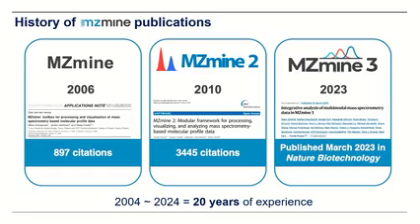Now, as you probably know, MZmine has quite a bit of history around it. We actually just celebrated the 20 years anniversary of this project, and that you can see from these publications in 2006 about MZmine first generation, 2010 about the second generation, which has been cited quite many times, and last year we published a paper about MZmine 3 in Nature Biotech.